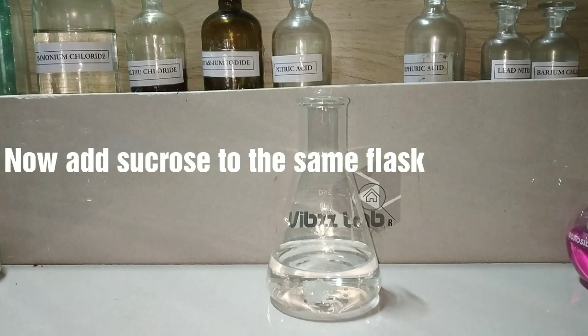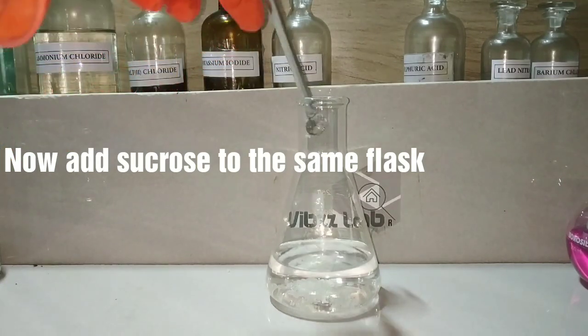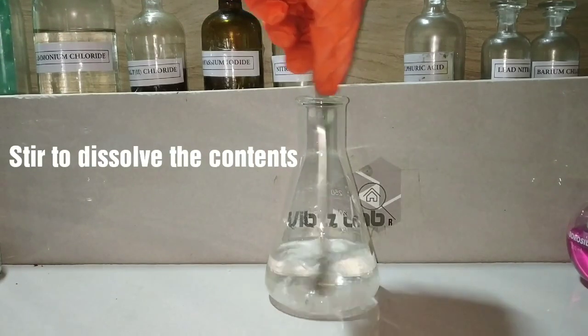Sucrose is table sugar with the formula C12H22O11. Stir the contents to dissolve the sucrose.